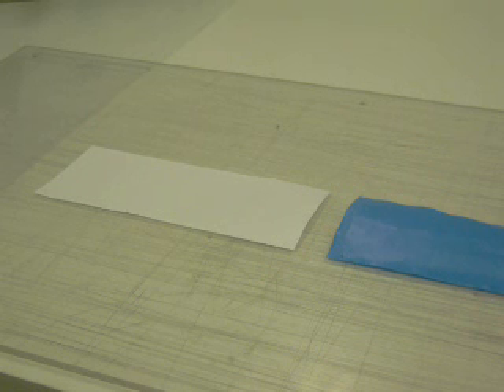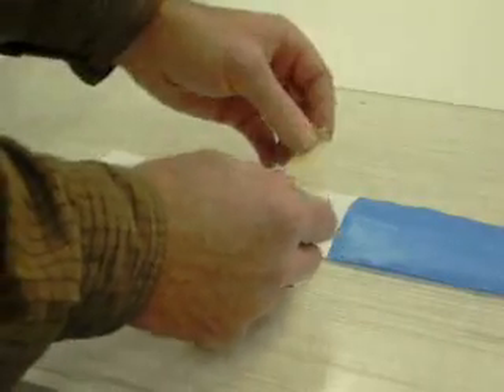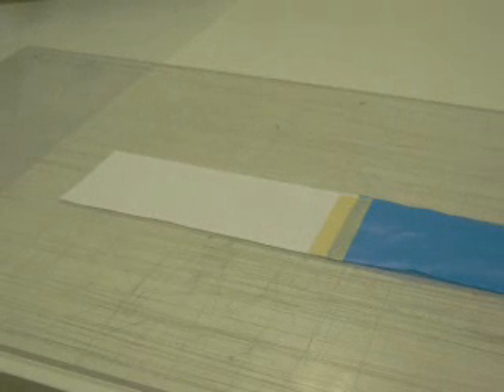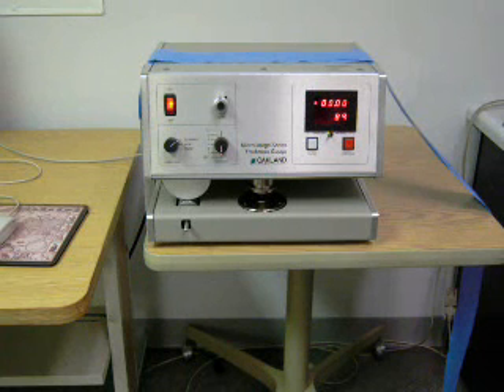To measure samples from the leading edge with the MX-1210 profiling micro gauge, you can tape a leader to the beginning of the sample and place the leader under the drive wheel to begin the sample measurements at the sample edge. Tape the approximately 5 inch or 125 millimeter long leader to the leading edge of the sample strip. Place the sample or sample leader under the drive wheel by pressing and releasing the lower spring-loaded idler wheel.